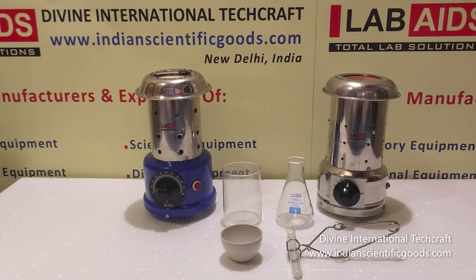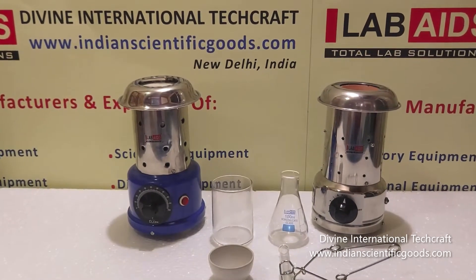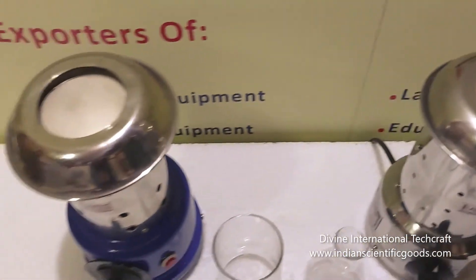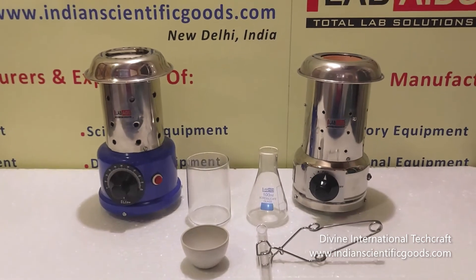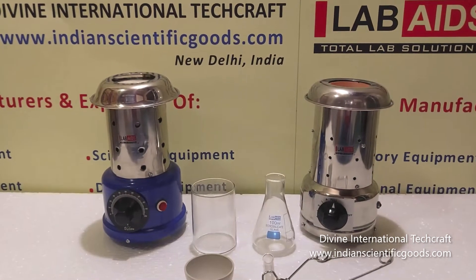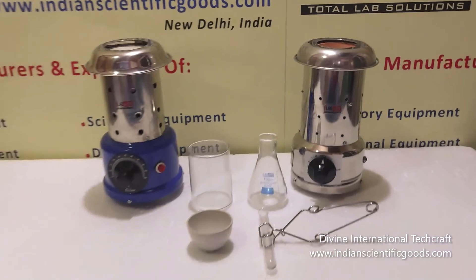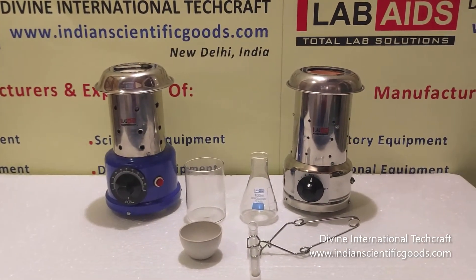The replaceable heater assembly consists of a coiled resistance heater. This, in turn, is formed around the outer surface of a ceramic bowl. The heater assembly is then mounted in the top of the Bunsen's cylindrical housing.